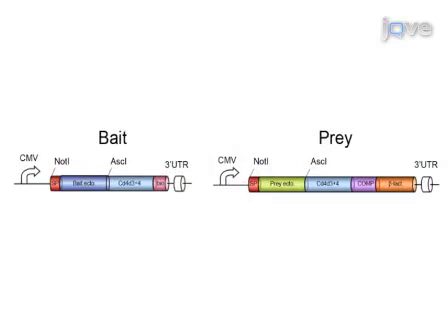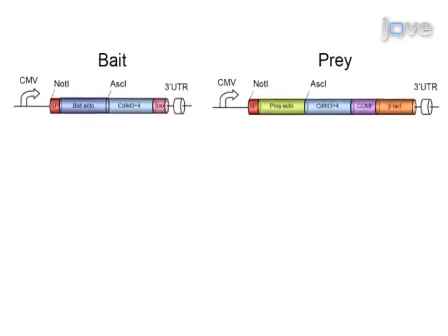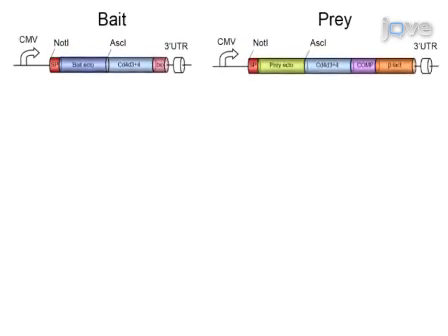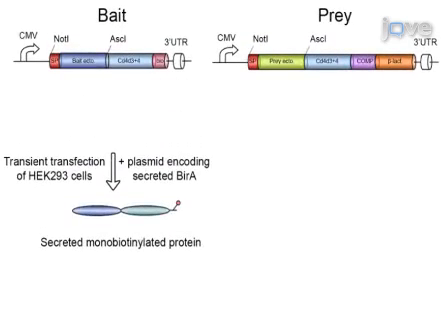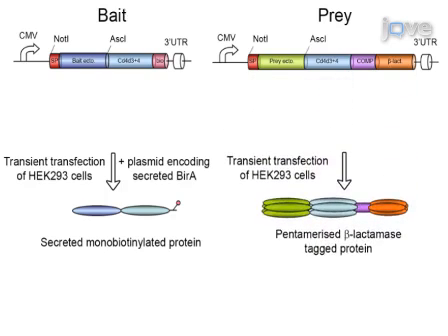This is accomplished by first compiling a recombinant protein library of the extracellular regions of cell surface receptors. This is achieved by designing expression plasmids to produce the ectodomain regions of the receptors as soluble fragments as both monomeric biotinylated baits and pentamerized enzyme-tagged prey.